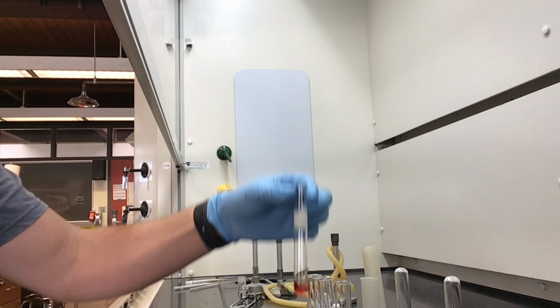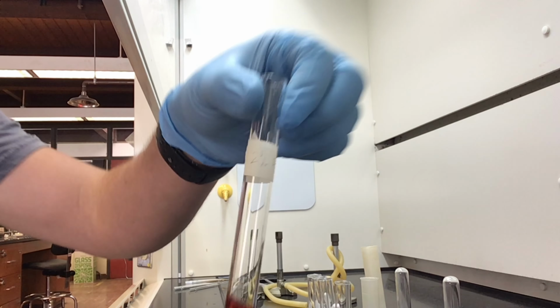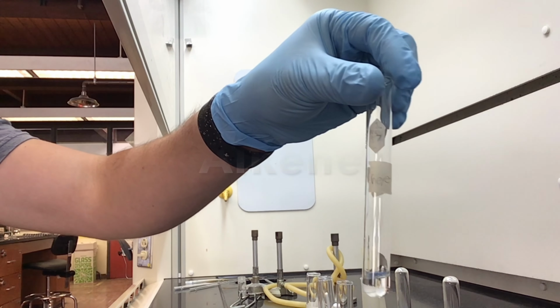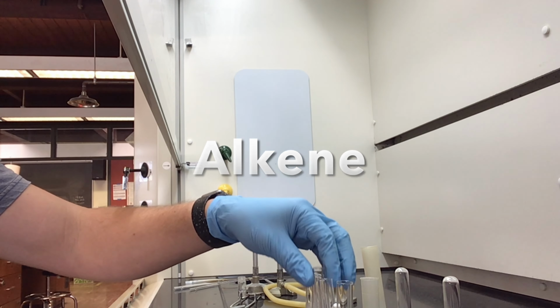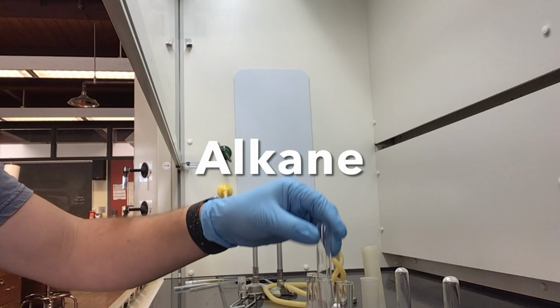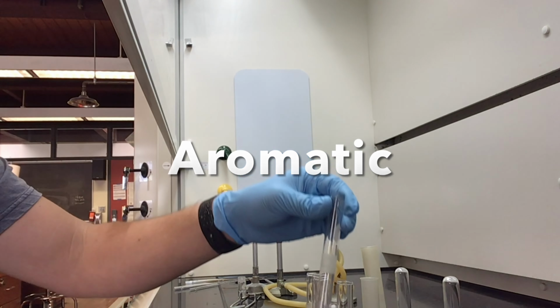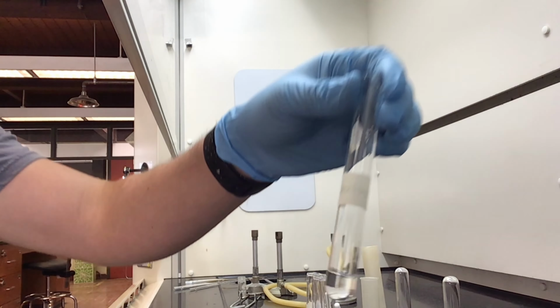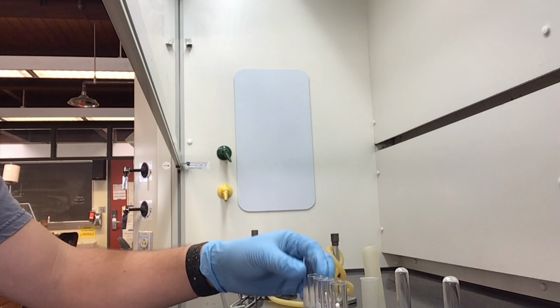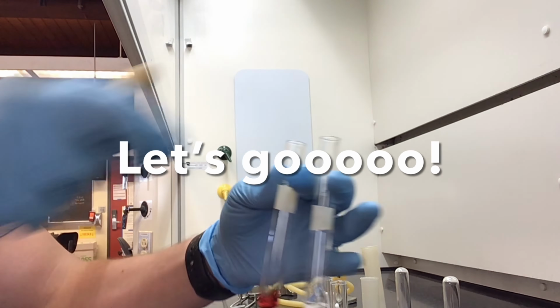All right, there's my samples all prepped because you know how we do. Now I got 2% bromine in methylene chloride. It's got a beautiful color as well. All right, so here's my alkene. It just so happens to be cyclohexene, but here's my alkane. Let's see what happens with that. We're gonna mess around with a little aromatic compound, toluene, and we're also gonna play with acetone, a ketone. Very basic ketone, the simplest form, I should say. Let's go.